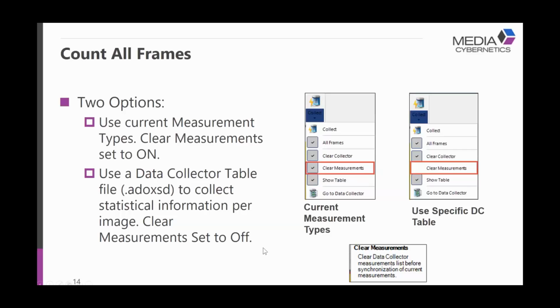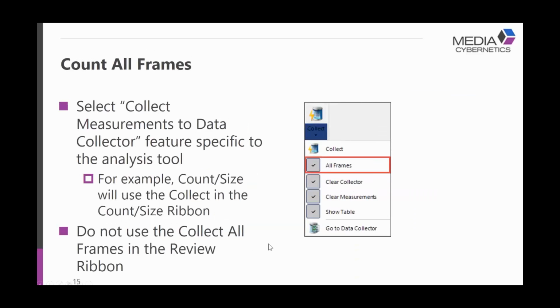Again, I'm going to go through this live so you can see it in both fashions. This is primarily the same workflow that we've done. One important thing, once we have this set up and you're ready to go, you'll simply press the count button or the collect button. Either one is the same. You collect here. It's just how you have the preferences set.